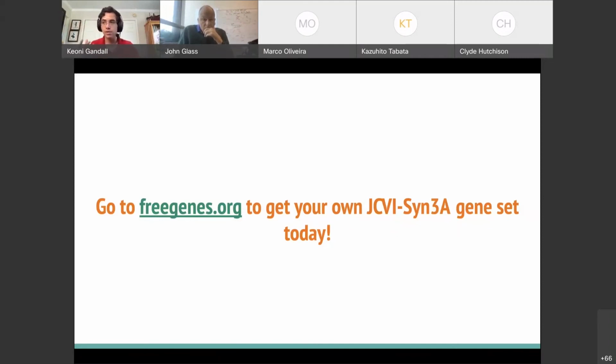The other thing is that we did try to reclone some of the genes into medium copy vectors, of which the ones that failed, pretty much all of them worked once you move them to medium copy. And in a different gene set, not in these, when we took genes that failed at Twist and just asked them to make them again with different recodings, they were able to succeed at the same percentage of the time. The vectors that these come in are also transcriptionally isolated with some pretty good terminators around there, so we would hope there's no leaky expression, but not sure about that.